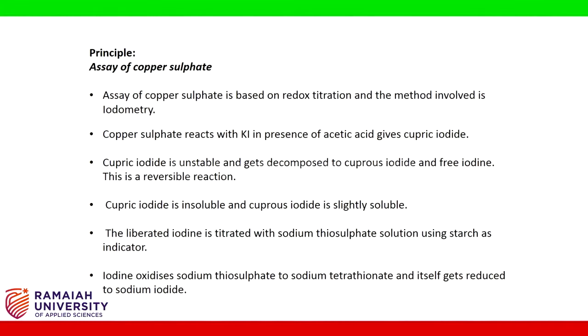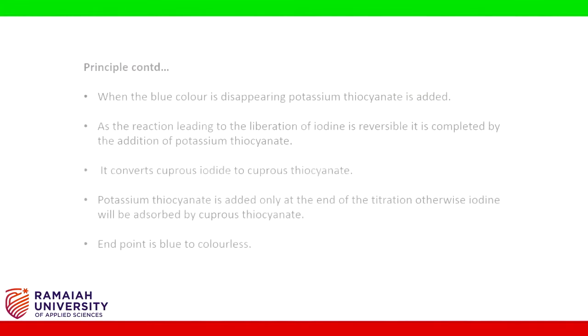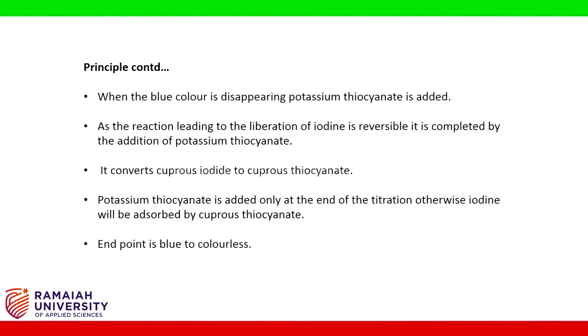The liberated iodine is titrated against sodium thiosulphate using starch as indicator. Iodine oxidizes sodium thiosulphate to sodium tetrathionate and itself gets reduced to sodium iodide. When the blue color is disappearing, potassium thiocyanate is added.